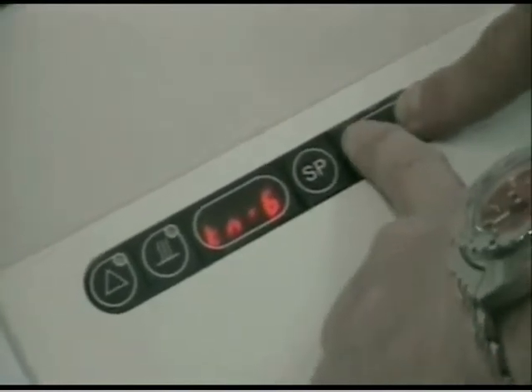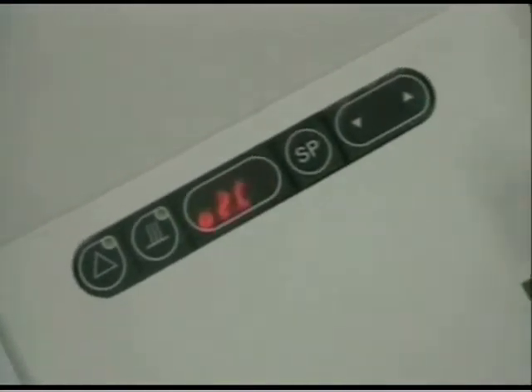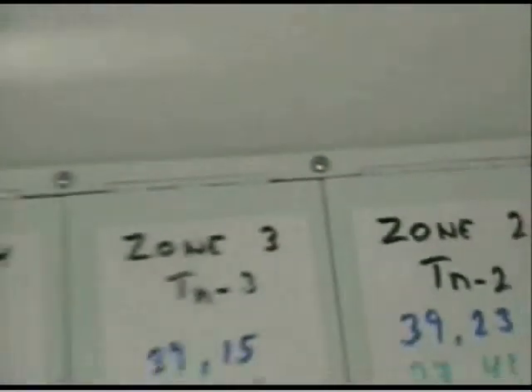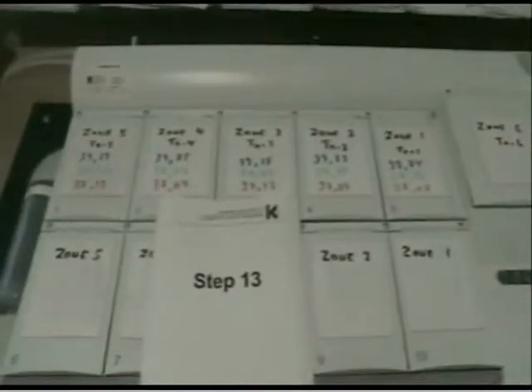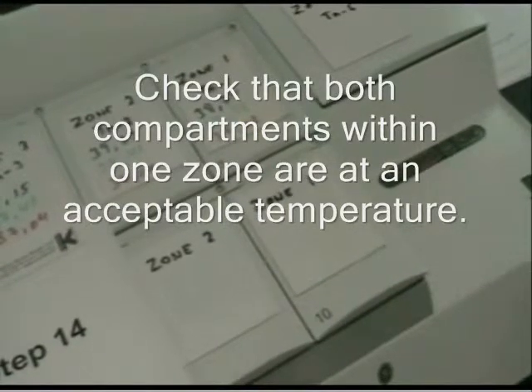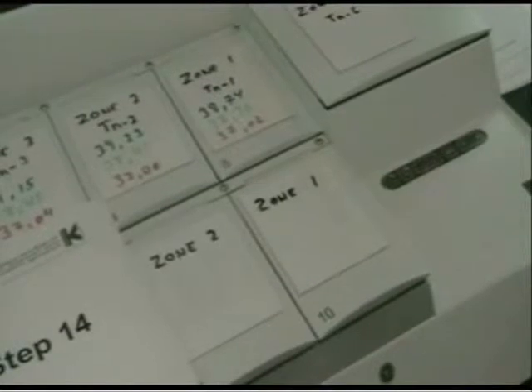We exit the menu to store the values. Now we can let it stabilize — it should be fully calibrated. We do a fourth measurement iteration to make absolutely certain. We have finished calibrating zones 1 to 5 and achieved acceptable values of 37.0 or near 37.0 in all of them.